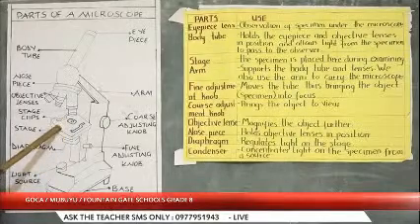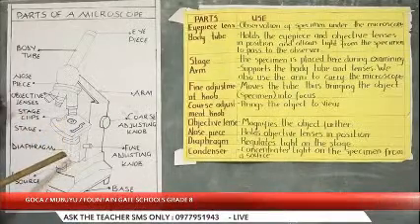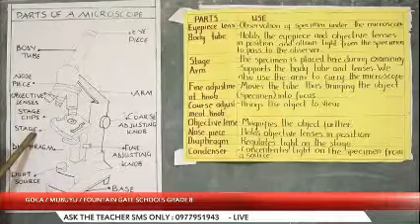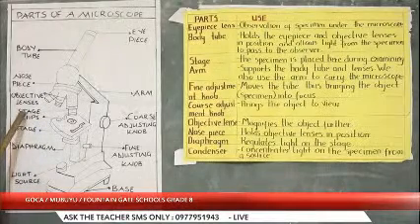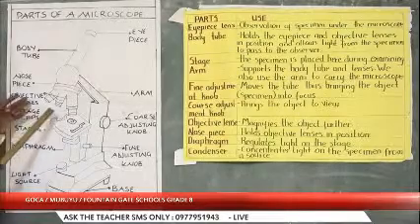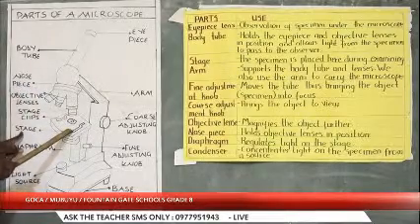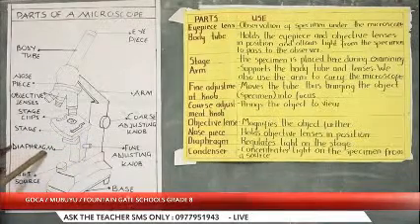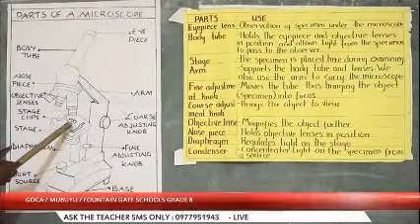Okay, so this stage, what if you put a specimen on the stage? You do not put a specimen on the stage directly, but you put the specimen where? On the stage clip. Then the stage clip is right on top of the stage itself. Are we together? So they're telling us that the diaphragm is the one that regulates light to the stage.